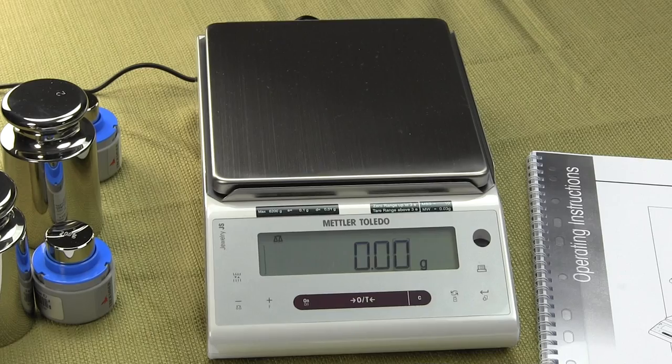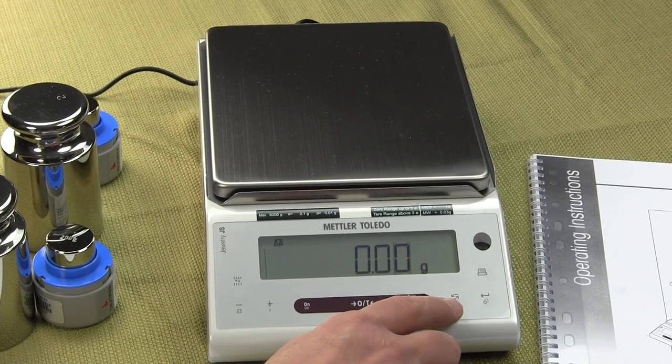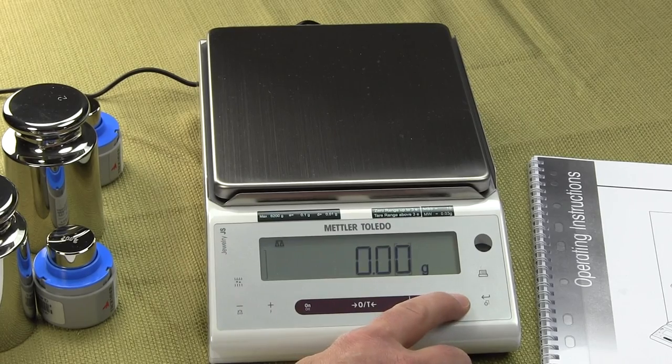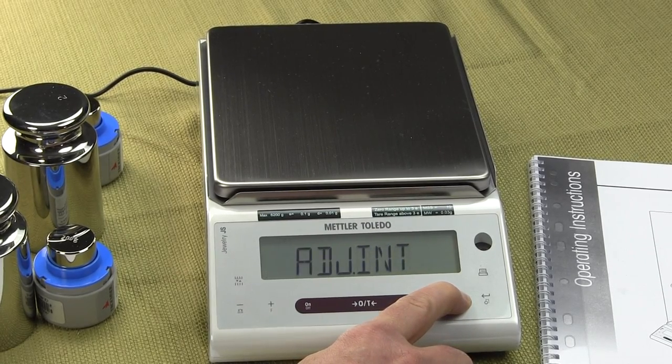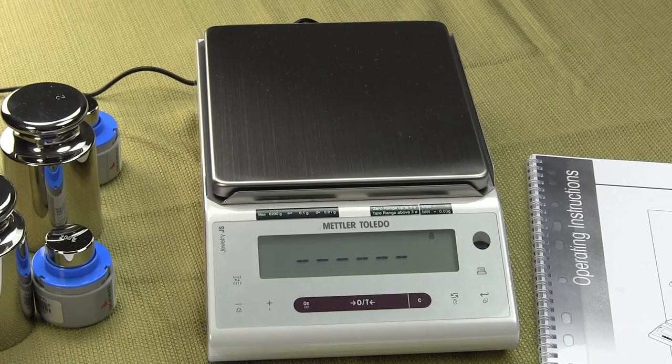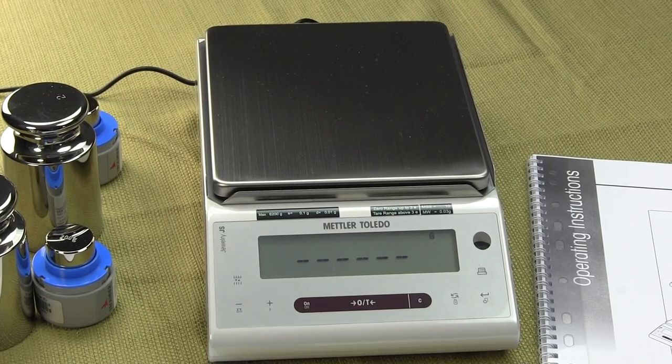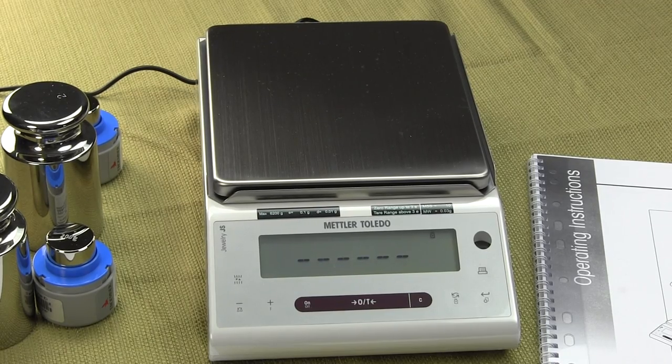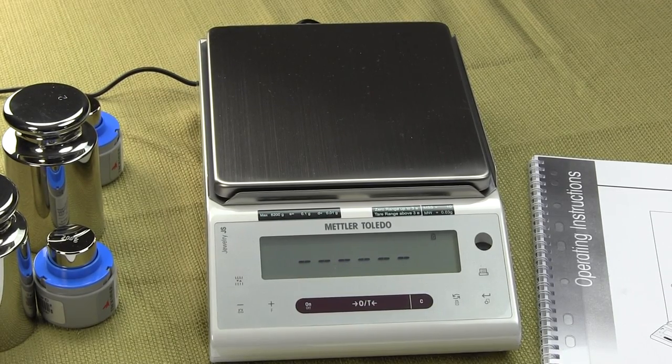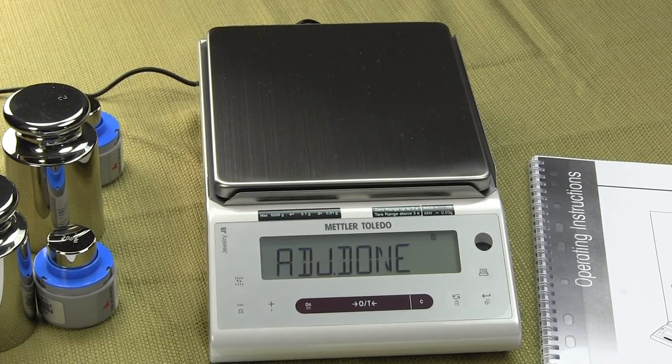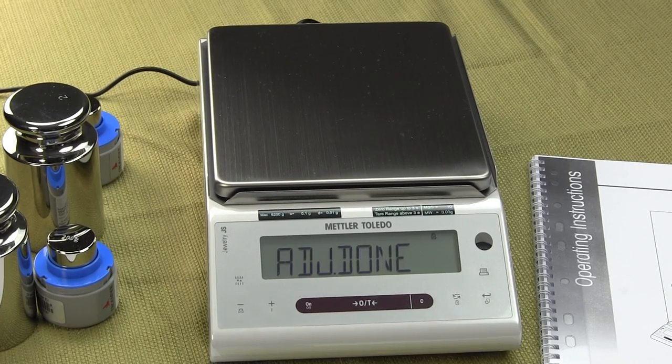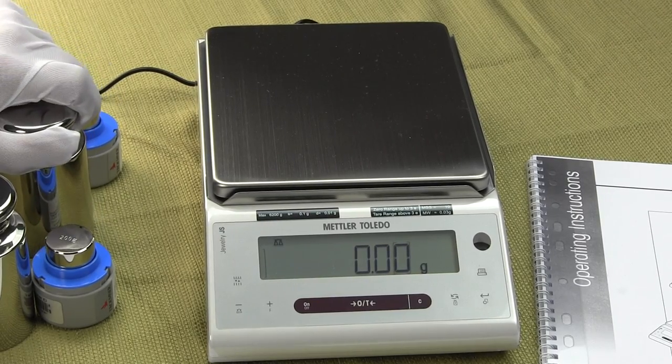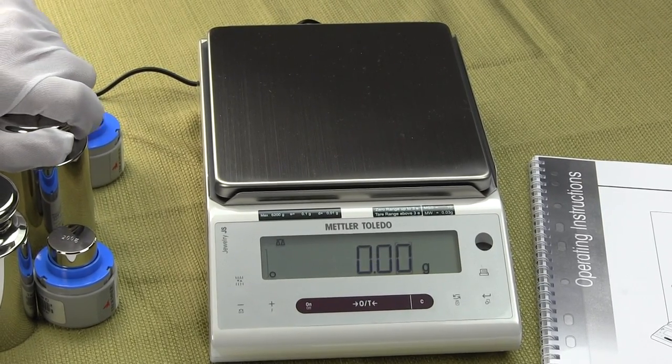this has motorized internal calibration. One simply presses this button over here and you hold it down to perform the calibration. Adjust internal. That noise you heard was the motorized internal calibration lowering the weight inside the balance.